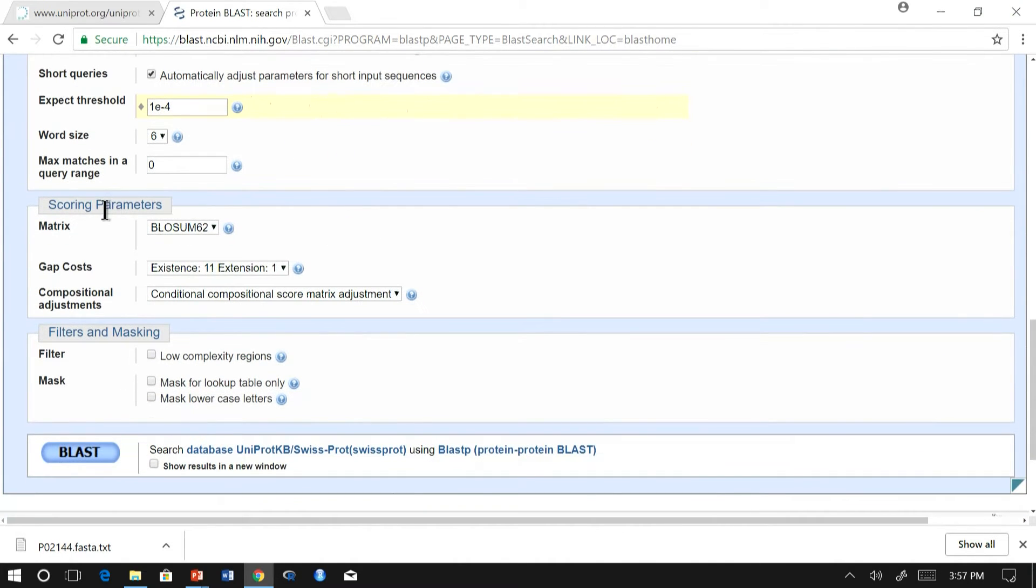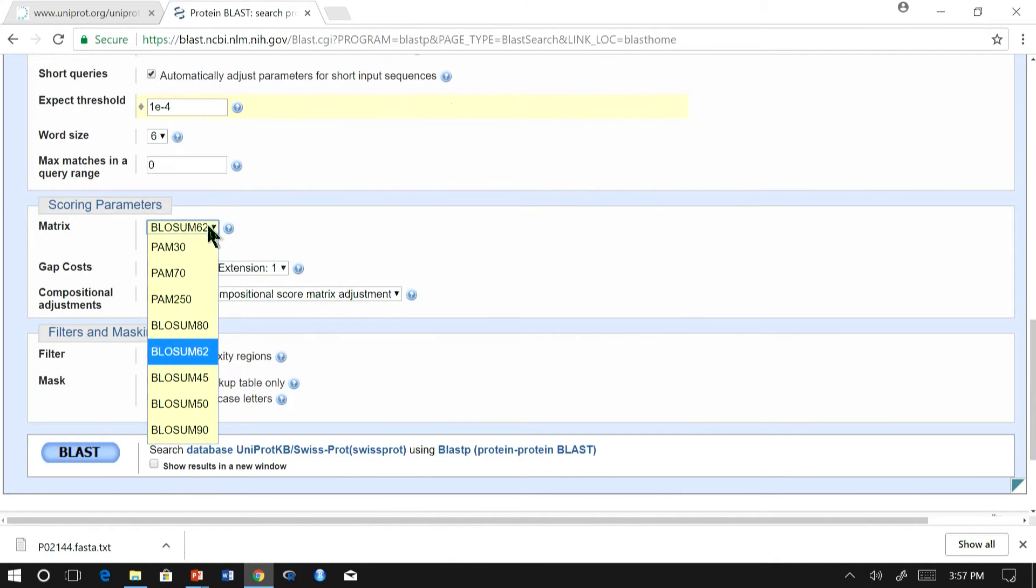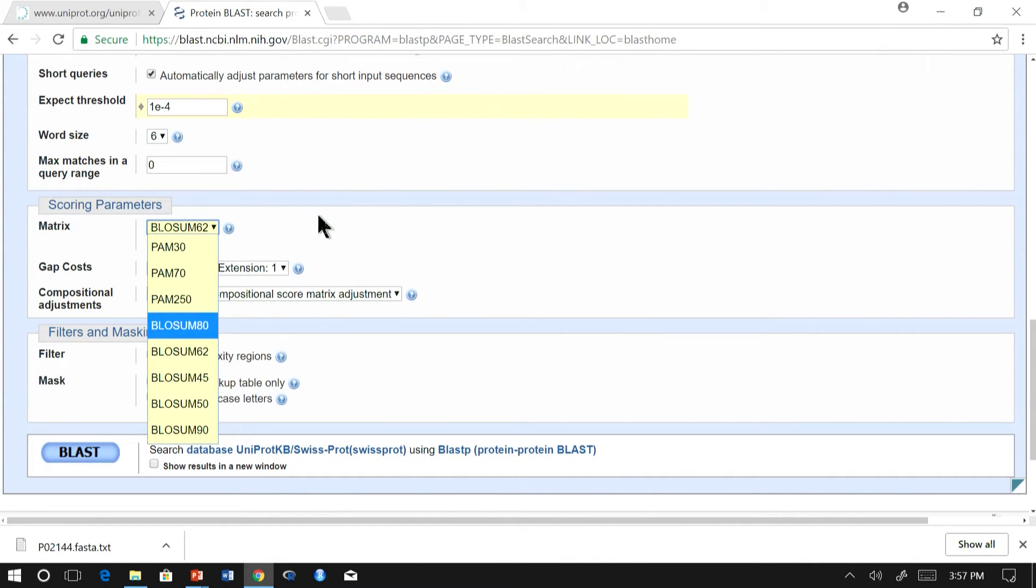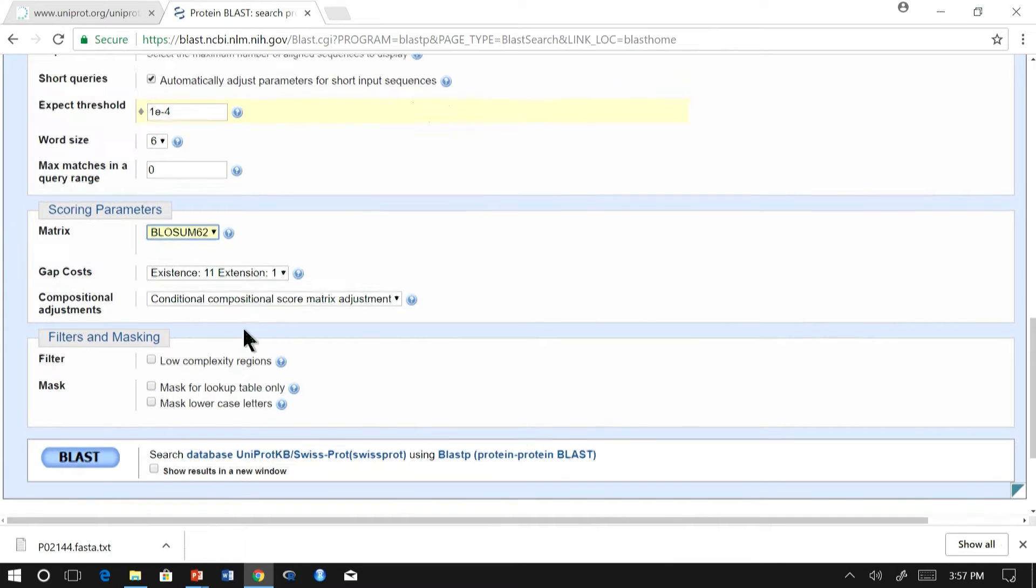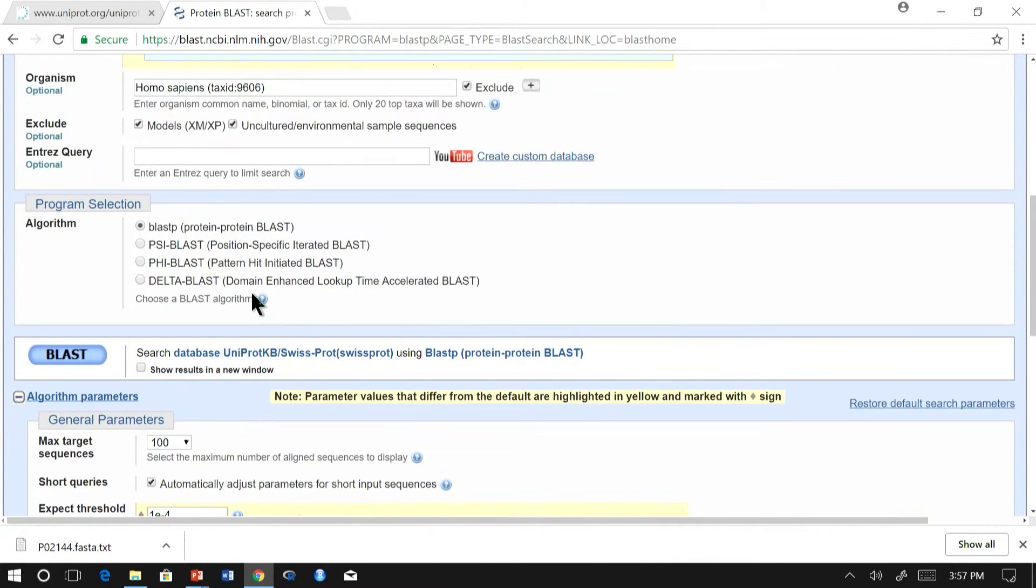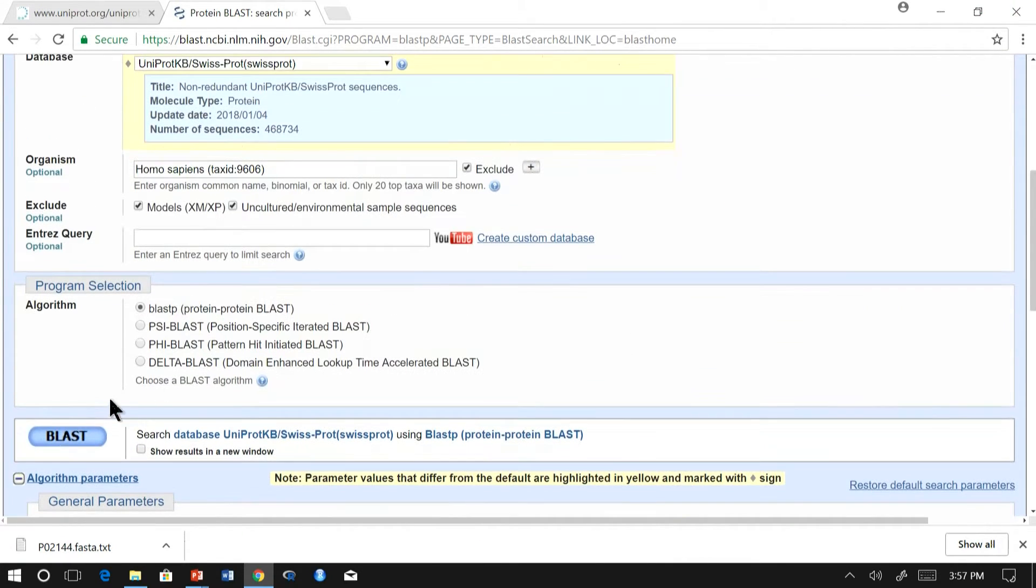And there is a scoring parameter which we learned, BLOSUM62. In case you want to change that based on your constraints or your problem statement, you can change it. And finally, if you are okay with the parameters, click on BLAST.